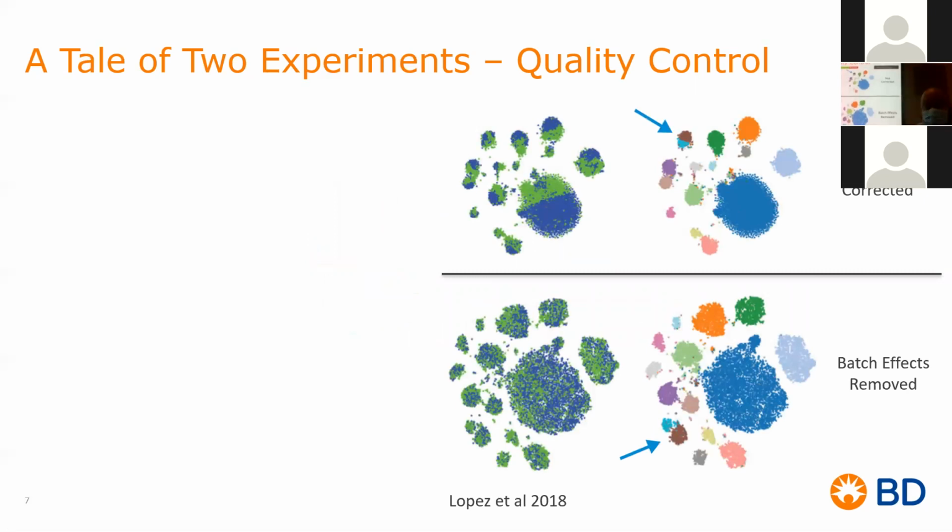The next portion, still with QC, is batch correction. If you're running the same experiment at different runs, you need to remove any batch noise, batch effects. On the blue arrow, on the top one, you have not corrected the data to remove batch effects. And you see that it's putting together these two populations, the blue and the brown, as the same cluster, as the same island, or maybe two different clusters but extremely similar. When in fact, that's not the case.